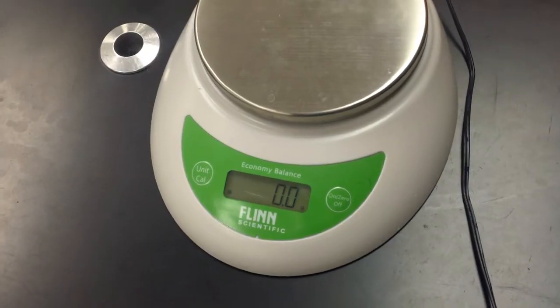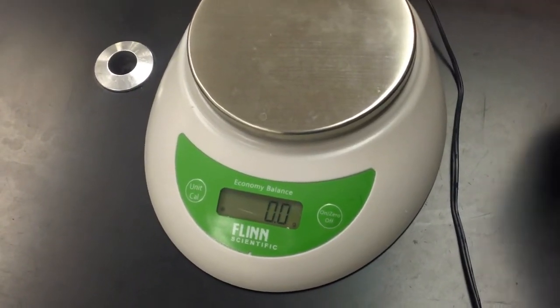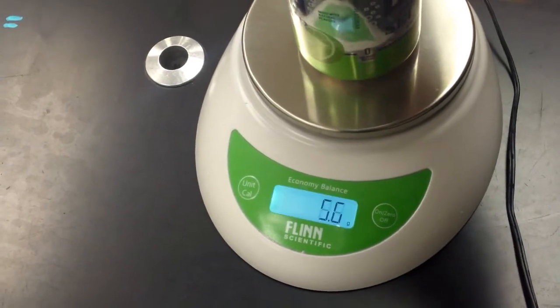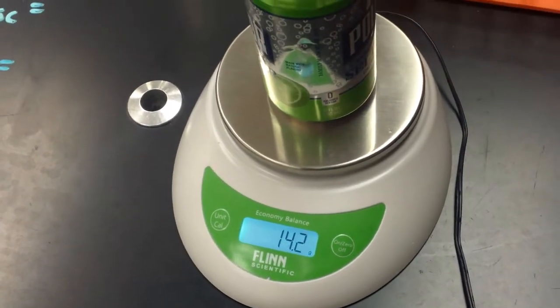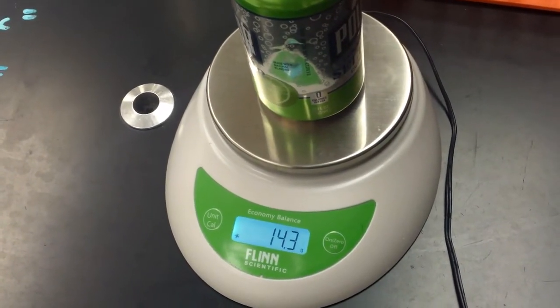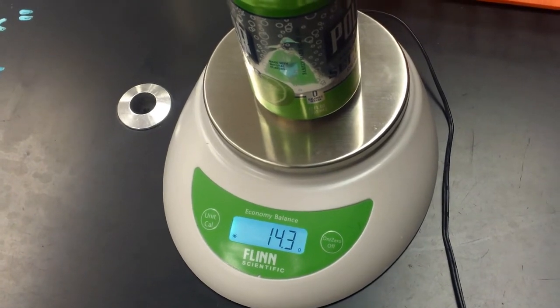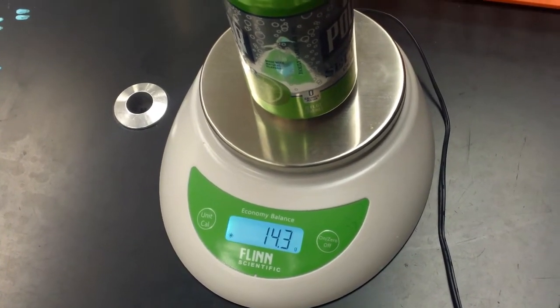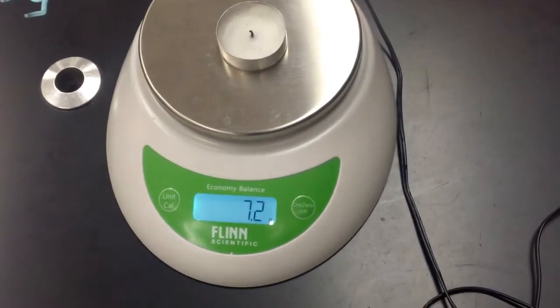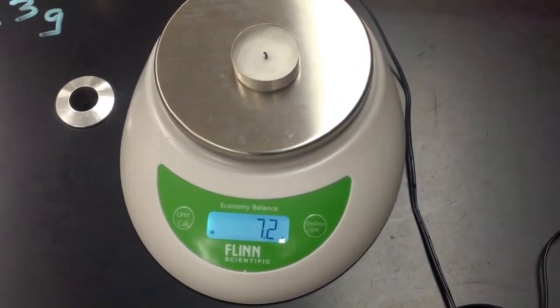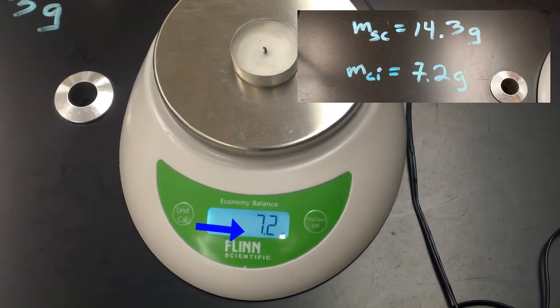I want to make sure the balance is zeroed. It's reading 0.0. We'll put the empty soda can on the balance and we see that it is measuring 14.3 grams. The initial mass for the candle is 7.2 grams.